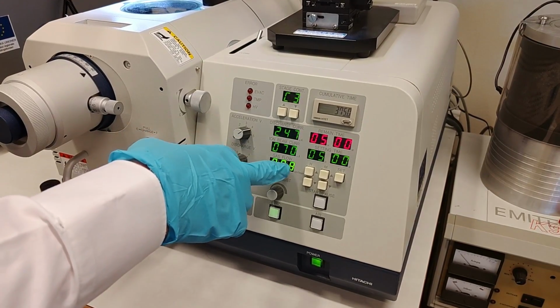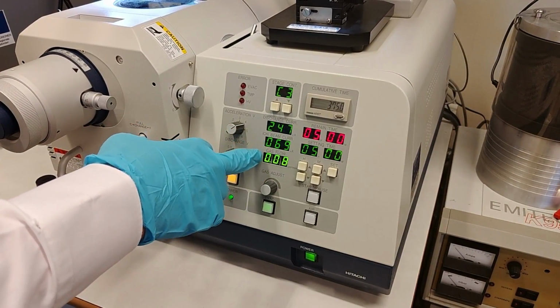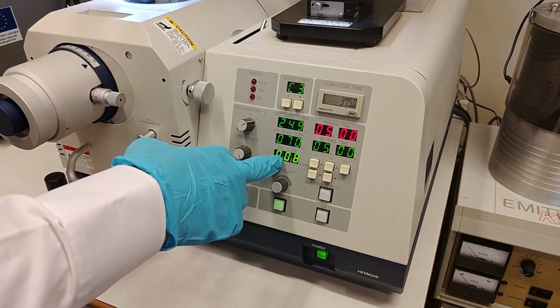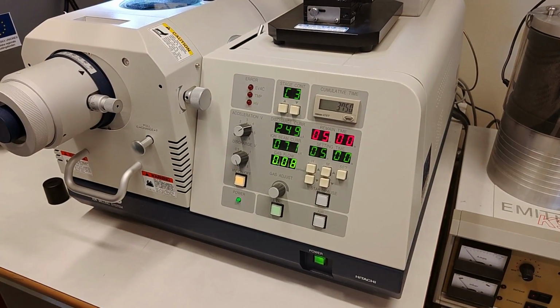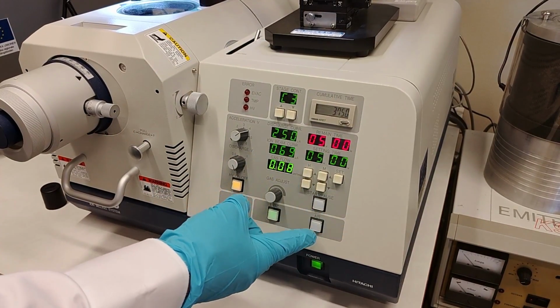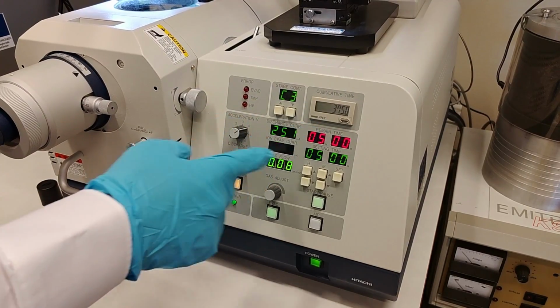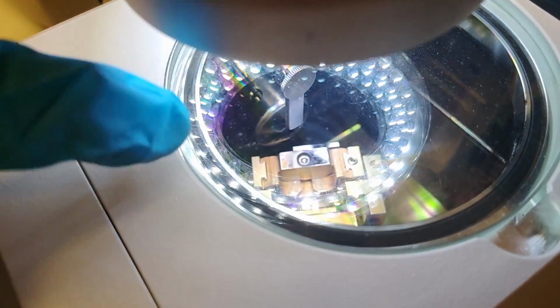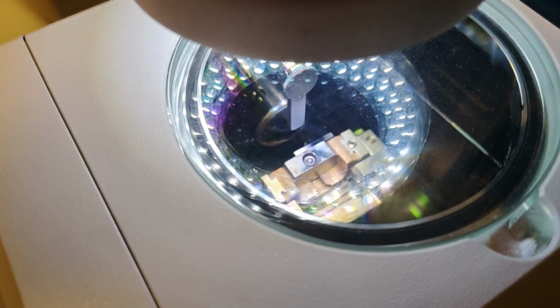These other meters usually are not of any use for the normal user, but what you can look at is this gas flow. It should be between 0.10 and 0.05 or something like that, so 0.08 is nice. And when you reach this stage, you just click start. And then you see this beam current goes blank, and if you look down here now, you can see it starts to oscillate back and forth. So that is this C3 program that's going.